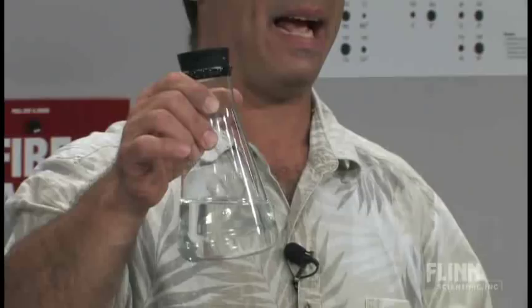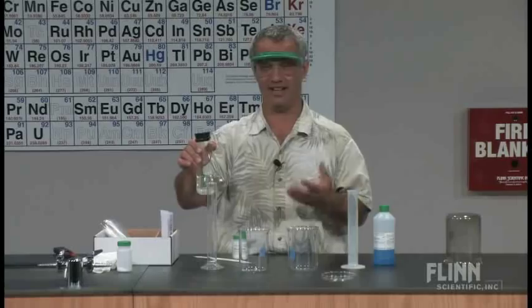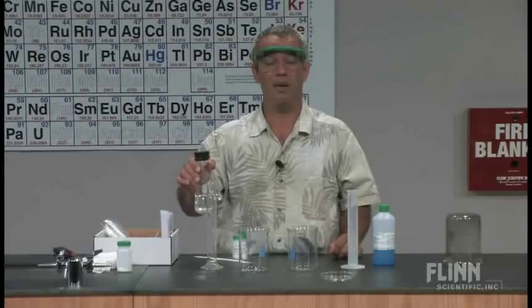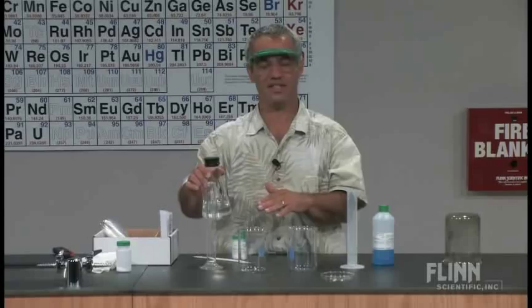Now, the way I make that up, to be honest, I put some tap water in a flask, I dump in a bunch of calcium acetate, it always comes as a powder, put a stopper on, shake it for maybe a minute or so, let the undissolved stuff settle. If it all dissolves, put some more calcium acetate in. When you have some that settles to the bottom, you just decant off the top stuff, and you get this nice saturated solution.